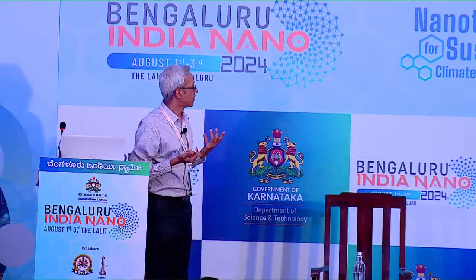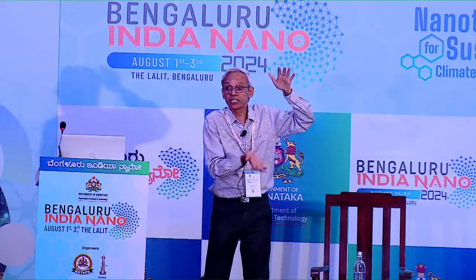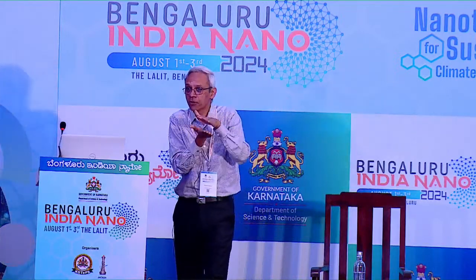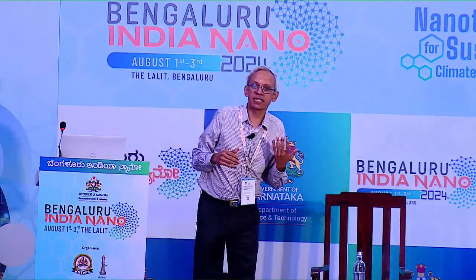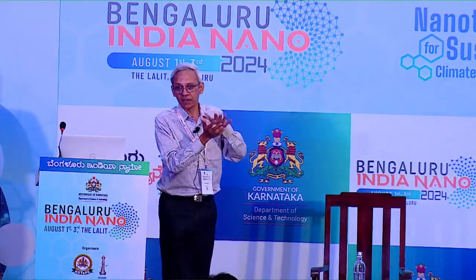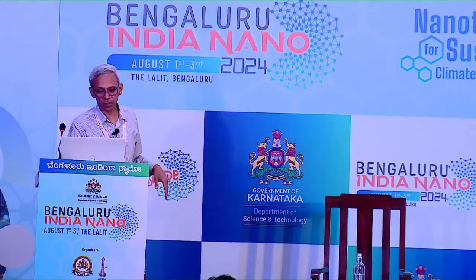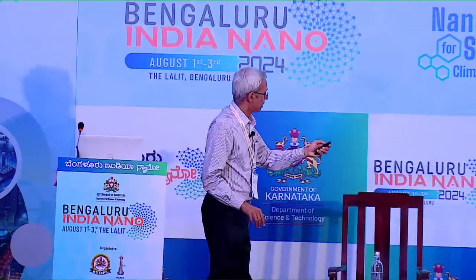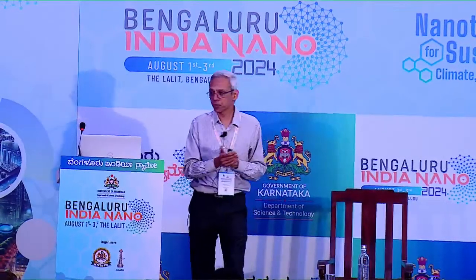So then what can we do? Obviously what we can do is to see what the width of that thing depends upon, how much it is spreading. And if you make it as narrow as possible, then we can improve our resolution. That is the whole idea. So the question is, what are the factors that basically affect how wide that thing is, right? So we want to make it as narrow as possible.